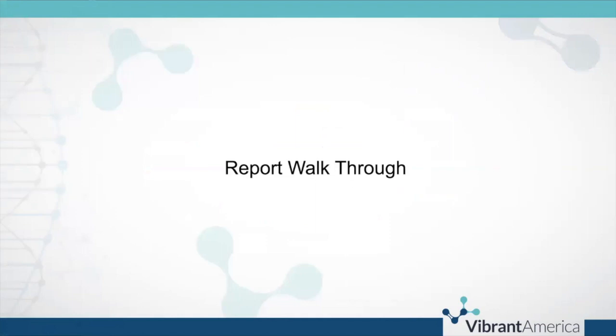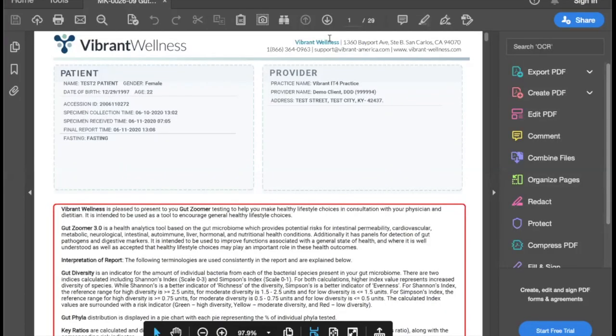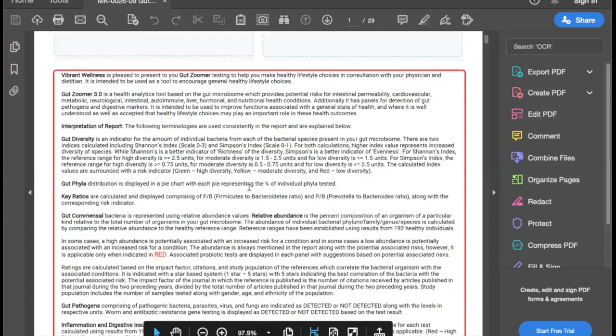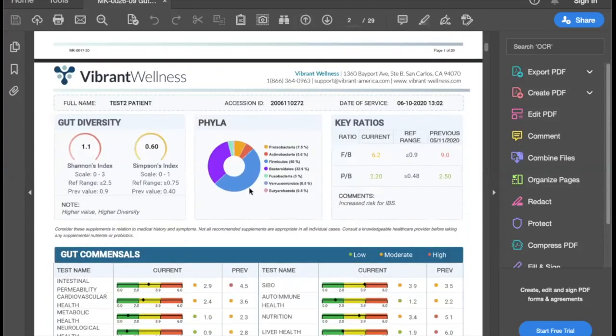Let's walk through the report quickly — let's spend about five minutes with the GutZoomer report. The first page is your 30,000 foot view. This page has a lot of information from which you can derive basic interventions for your patient. If you're unfamiliar with the test or it seems overwhelming because there is quite a lot of data here, this is an excellent page to start with to get your patient moving in the right direction.